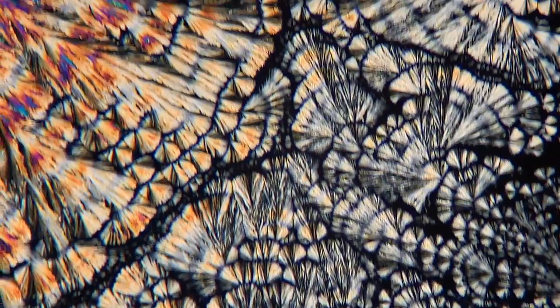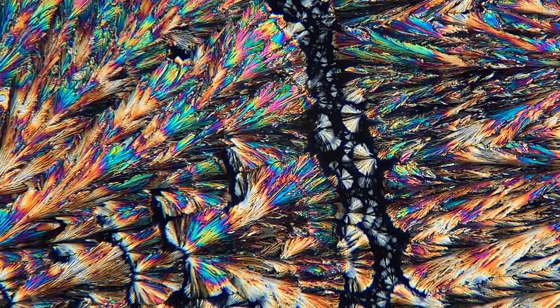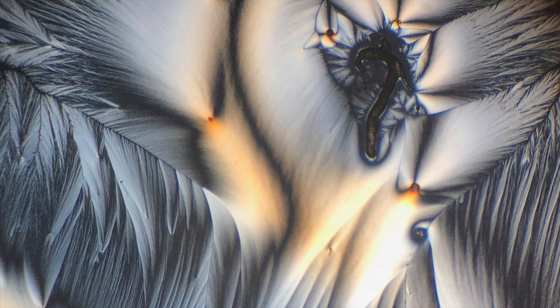Here's another really cool image — it's just a bunch of fan-like patterns that have so many different colors. It's just amazing. And this one's one of my favorites. I really like the textures that were created. When I was etching the glass, I accidentally created a little question mark, but didn't really notice it until looking at it under the microscope. And here's another cool picture — I really like this one because it kind of looks like a scarecrow sewn together.